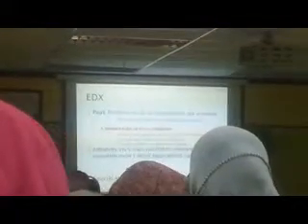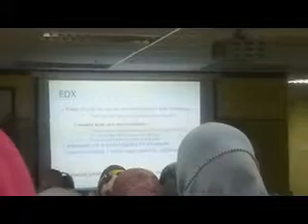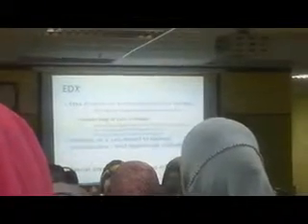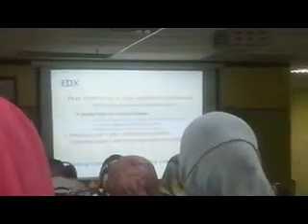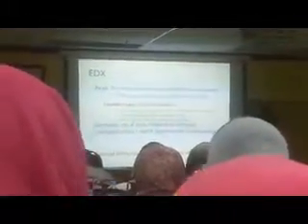You understand? So you have to have such knowledge because the machine sometimes simply assigns a peak to some element. It can happen, but as a researcher, you have to keep that in mind. Even though the peak matches with aluminum K alpha, whether it is aluminum or something else's L alpha, we don't know. So you have to look for the other peaks so that yes, it is that particular element. Okay? So we can get two things: peak position identifies the element, and intensity gives the composition from the EDX pattern.